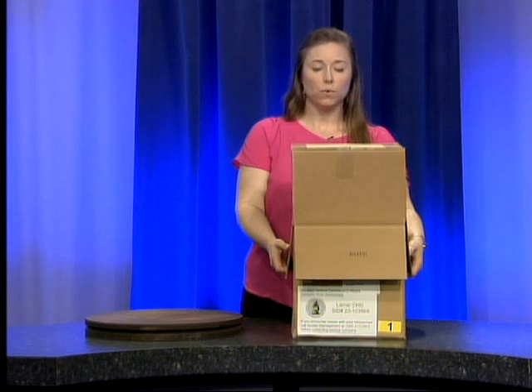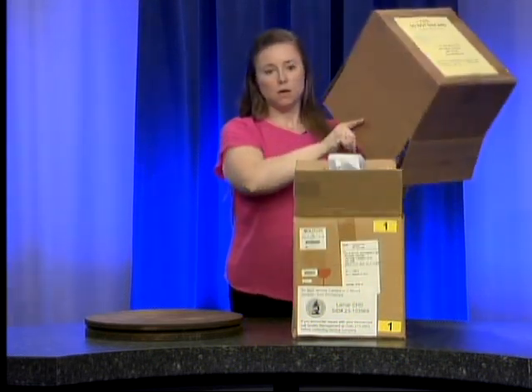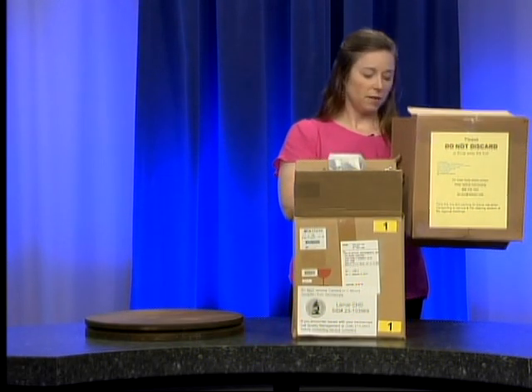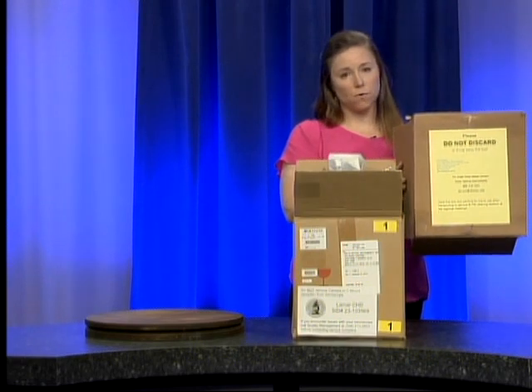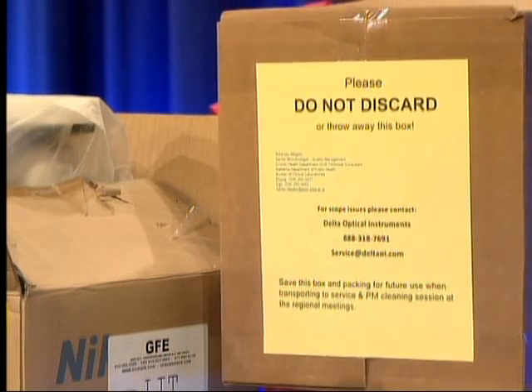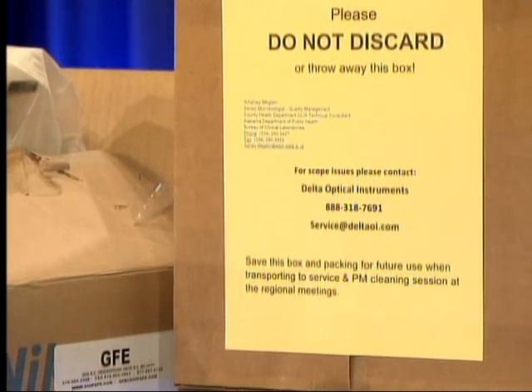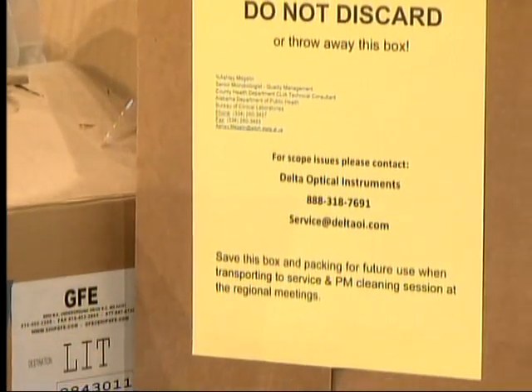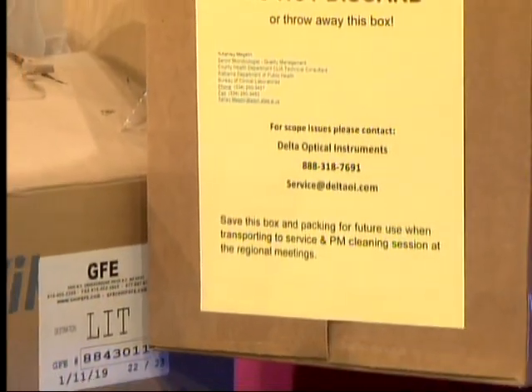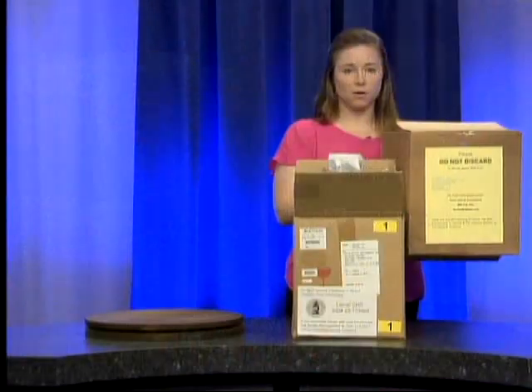Now we are going to get to unboxing. On the top of this box you will see that there is a yellow piece of paper. This has the information for the vendor that sold us the microscopes, including his telephone number. We will be using this person to service the microscopes in the near future, but before we call the vendor we would appreciate it if you would call a technical consultant in quality management so that we can help you with the problem possibly first before we have to call the vendor.